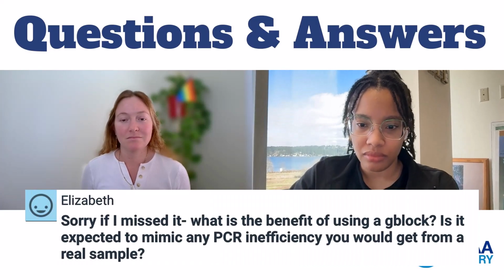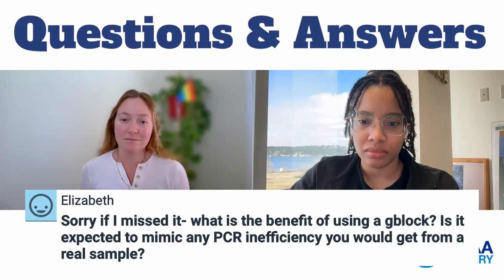So our question was, what is the benefit of using a gBlock? Is it expected to mimic any PCR inefficiency you would get from a real sample?